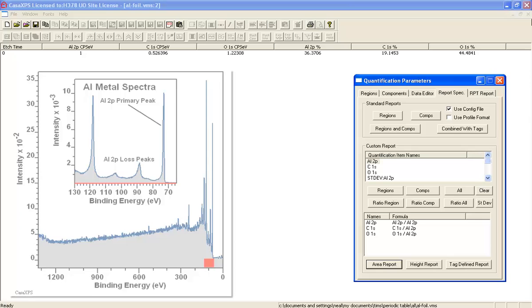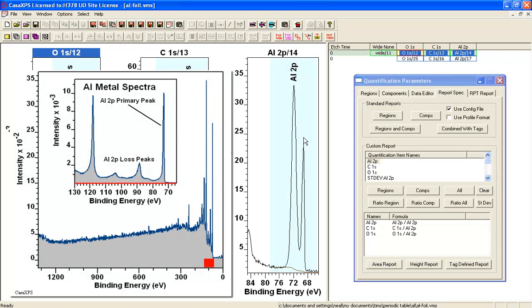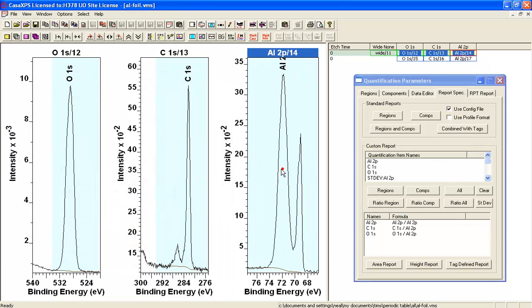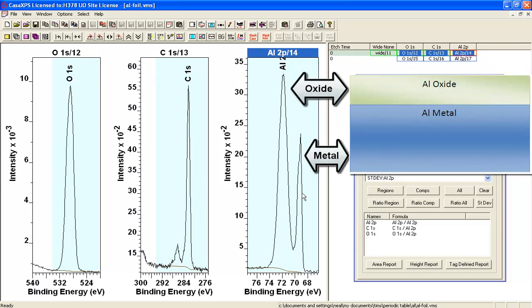Which is not quite what we'd expect, and hence the high resolution spectra were measured so that we can then further analyze the aluminum peak to separate out the oxide from the metal.